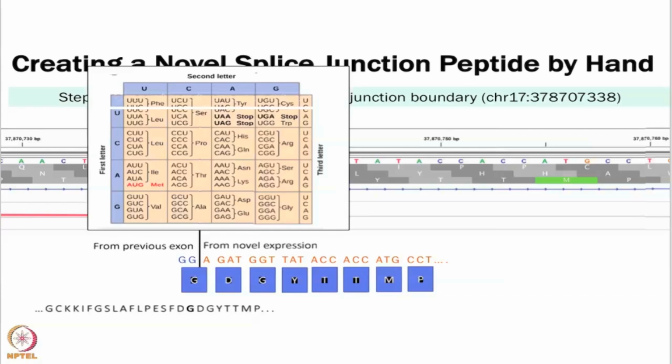So what you want to do is find the sequence here, and then the nucleotide sequence here, and then figure out what that would look like if it actually joined. If it actually joins, what will the amino acid be? First we are going to the genome.